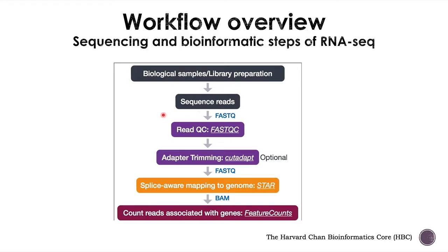You will then deal with the bioinformatic steps of an RNA-seq. First, you will quality check the reads. You will remove the adapters from the sequencing reads and assess their quality as well. Then you will align these reads to a genome using splice-aware aligners such as STAR. And finally, you will count the reads associated with the genes with software such as featureCounts.